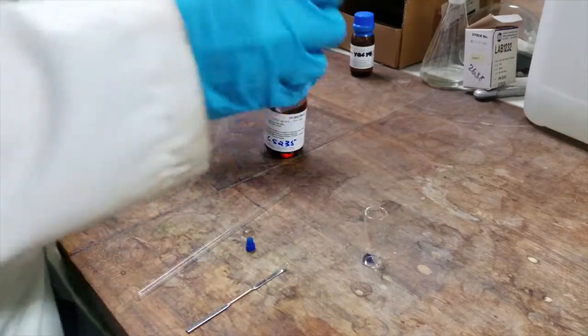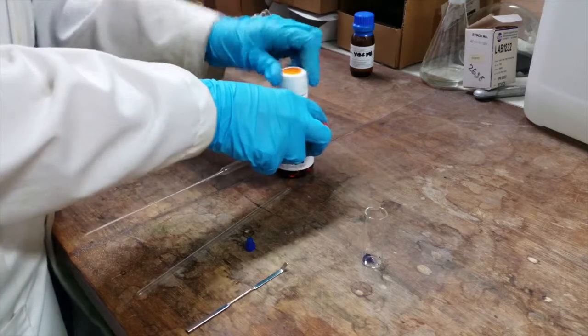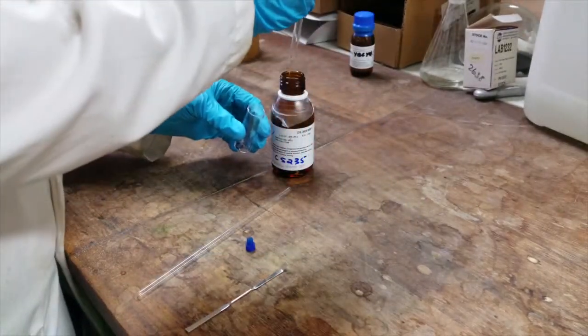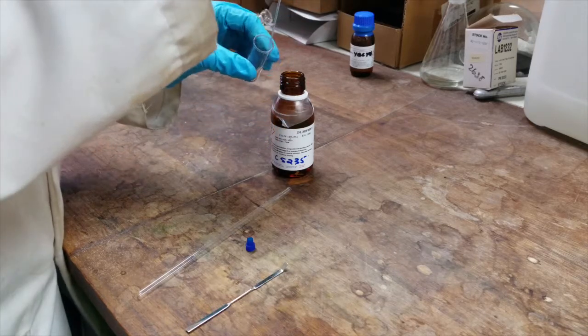Now add a small amount of your deuterated solvent to your sample. You'll need around one pipette full for each 10mg of your sample. Ensure that you do not contaminate the deuterated solvent as you're adding it to your sample.